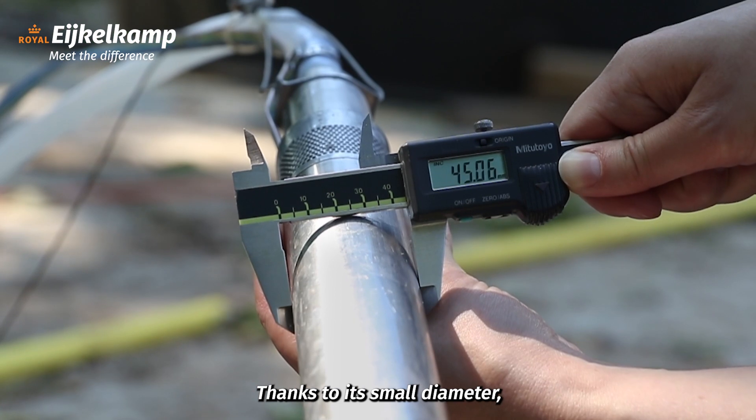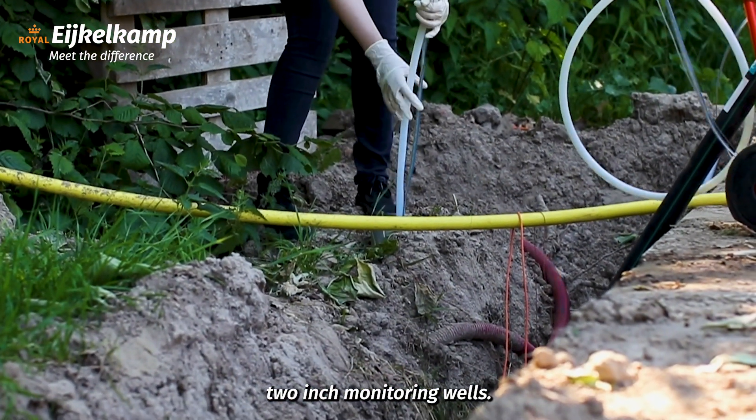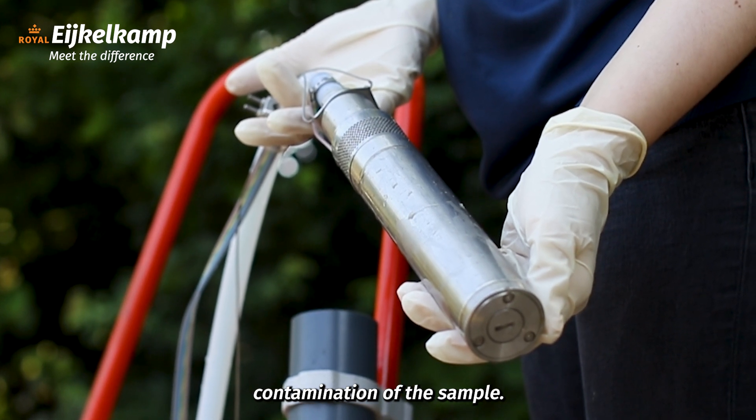Thanks to its small diameter, it fits even the smaller 2-inch monitoring wells. The pump housing is completely made of stainless steel, which helps to prevent contamination of the sample.